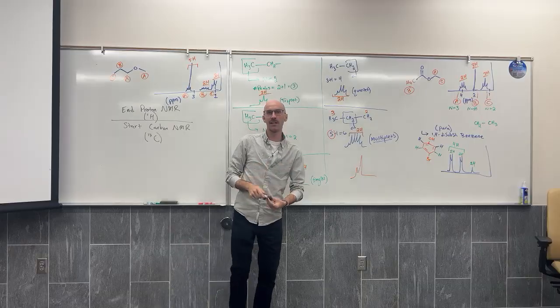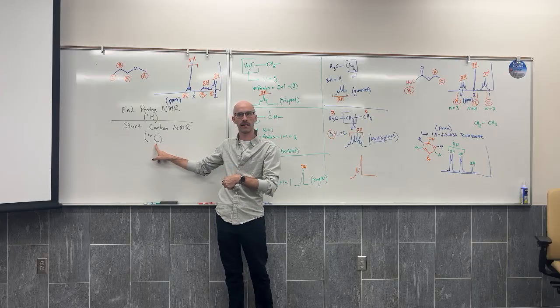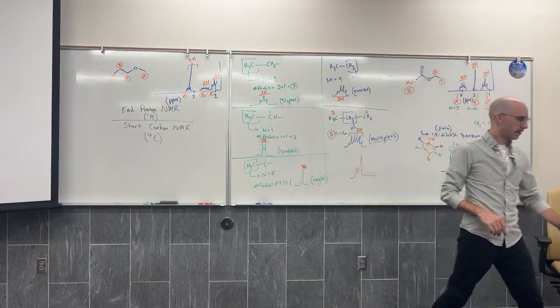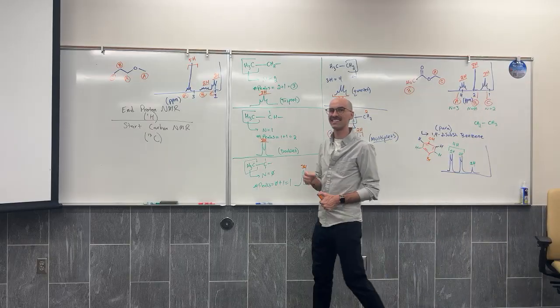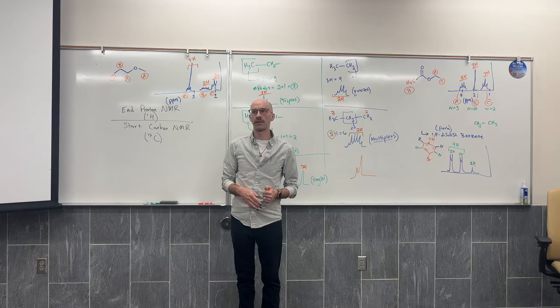You know, it's actually kind of funny. We call it C13, but it reads 13C because isotopic numbers always go on the top left. But we read it as C13. Carbon NMR is far less detailed than proton NMR, but shares very similar properties.